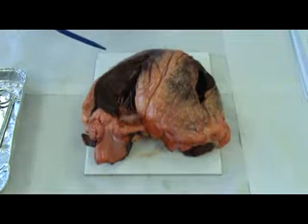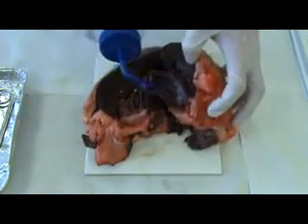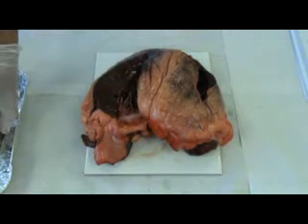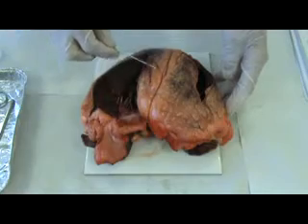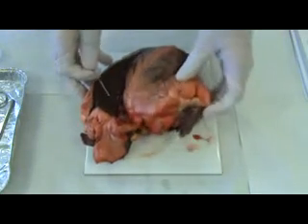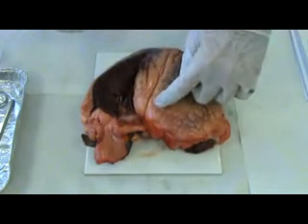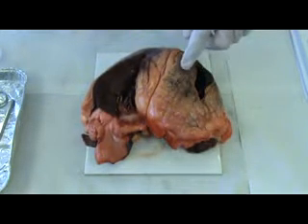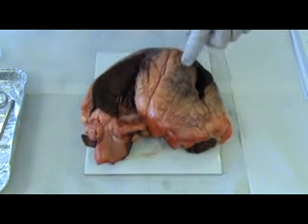Let's spray the heart with some water, just gently, in order to prevent it from drying out. It's always important. Now we're ready to have a look at the outer surface of the heart. The heart has quite a lot of fat, and the fat is quite thick there. If you have a feel of the fat, it's rather tough and hard, compared to the tissue of the heart, which is soft and smoothish.